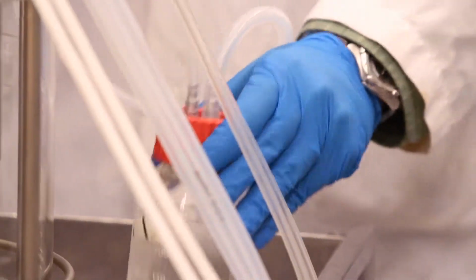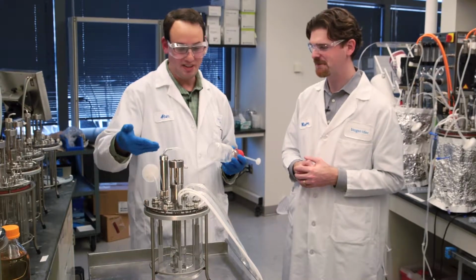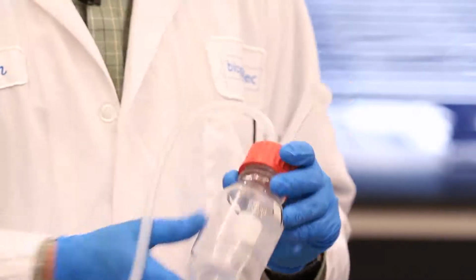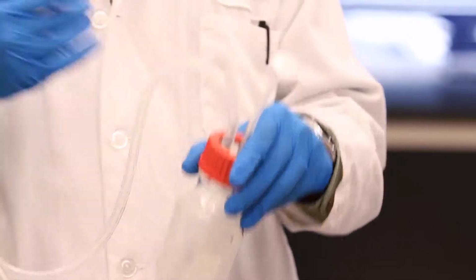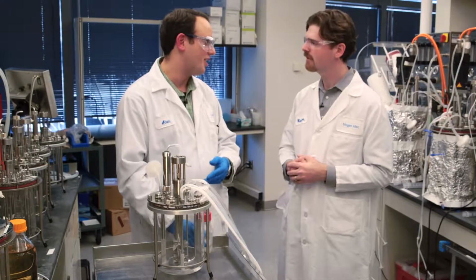So this bottle is basically our protection device. If you're getting a culture that's overflowing, it goes up the condenser and eventually will come out. So if it overflows, it has a long path to come down, it's going to drain by gravity, and it's going to get trapped in here, protecting your filter on your effluent stream.